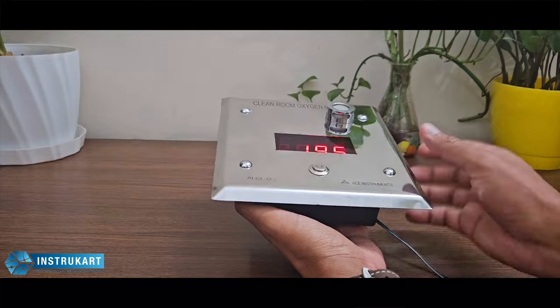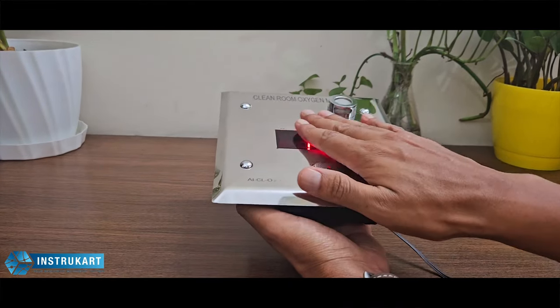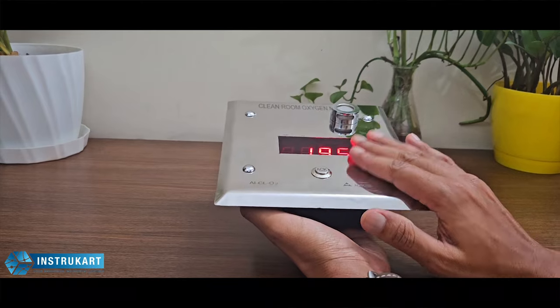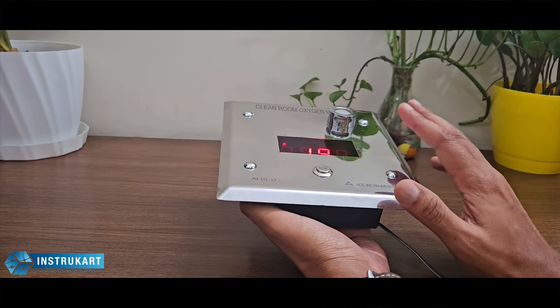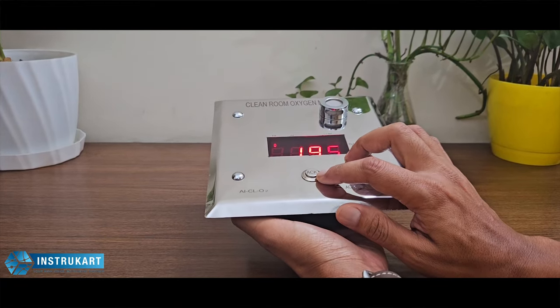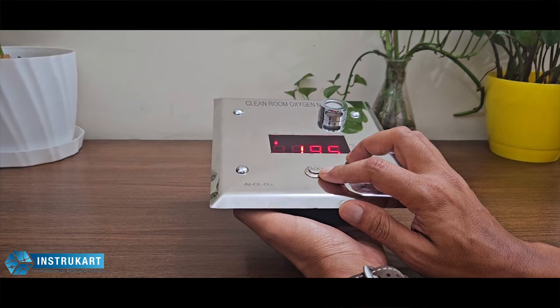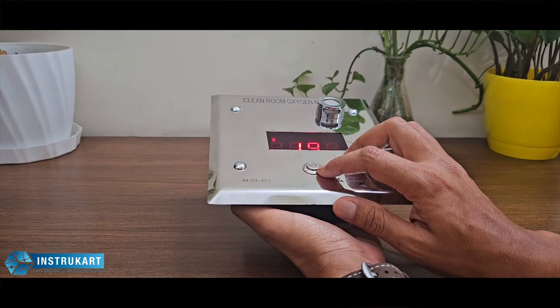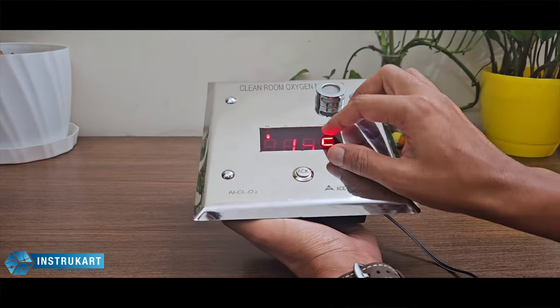This is a flush mount front stainless steel plate, which means it can very well withstand chemical treatment or the clean room treatment. It has got IP65 rating, with one acknowledgement button in case when the alarm goes beyond the set point, so the acknowledgement button ensures that a manual intervention is done.